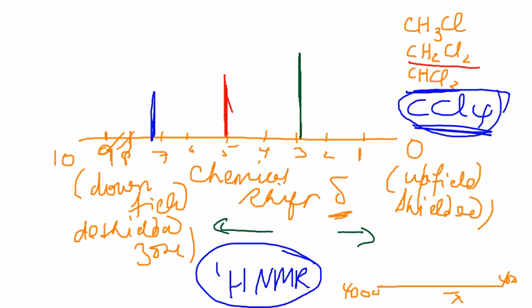All right, let's take a look at essentially where do these signals come in, and how do we decide on an unambiguous way to make sure that the numbers that we are seeing have been auto-zeroed. Okay, so let's take a look at that.